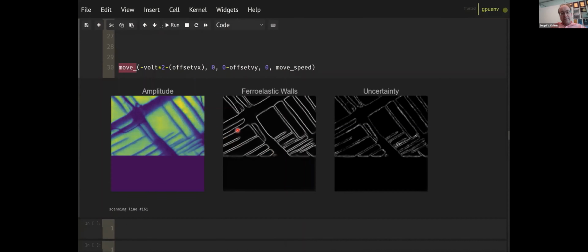So you can say that this is just an edge filter. If you look carefully, not really, because you can see that there are two types of domain wall here, the ones which are ferroelastic, like this, and the ferroelectric ones, which are much sharper. Notice that our neural network found the ferroelastic ones, but it ignored the ferroelectric ones.